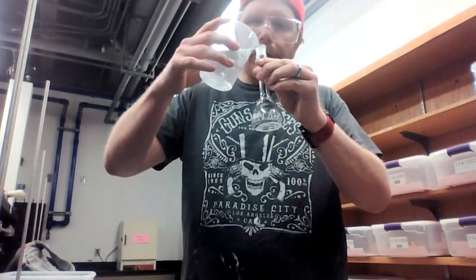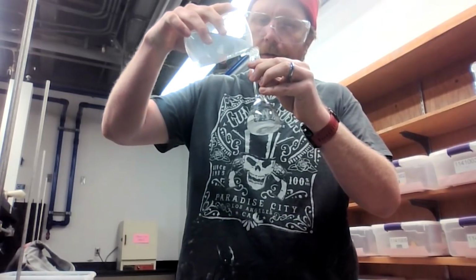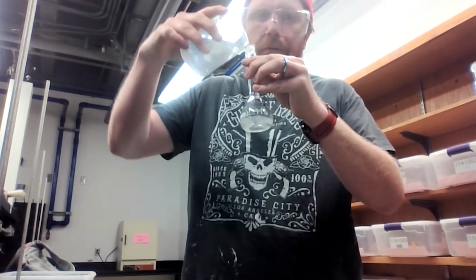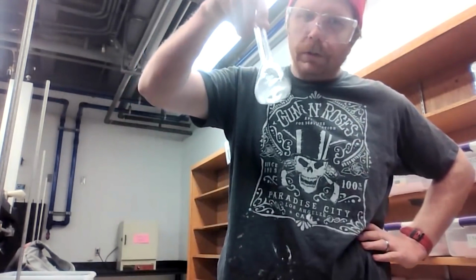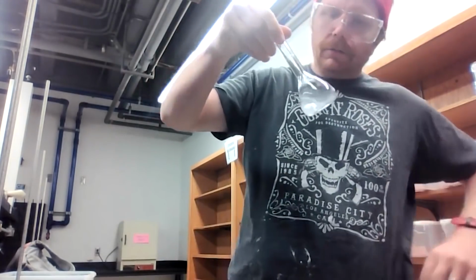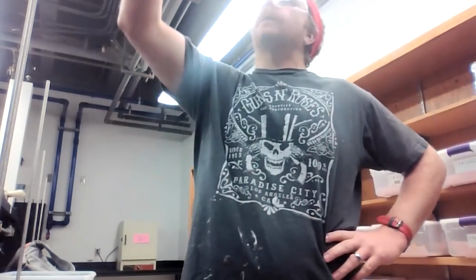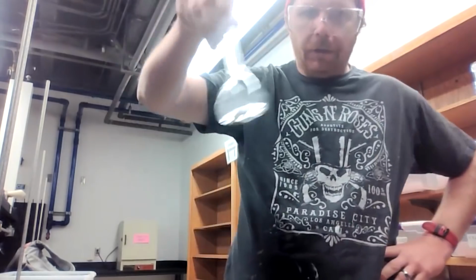I'm going to transfer water into this until my bulb at the bottom of this volumetric flask is approximately half full. I'm going to swirl, swirl, swirl, because I want this sodium chloride to go into solution. Now this takes a little bit of time, but you can see it's cloudy, but it's going into solution.